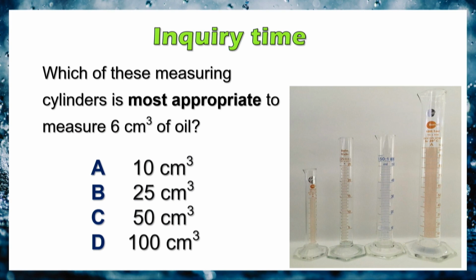Try this one out. Which one of these 4 measuring cylinders is most appropriate to measure 6 centimeter cube of oil? The 10 centimeter cube, 25 centimeter cube, 50 centimeter cube, or 100 centimeter cube measuring cylinder?